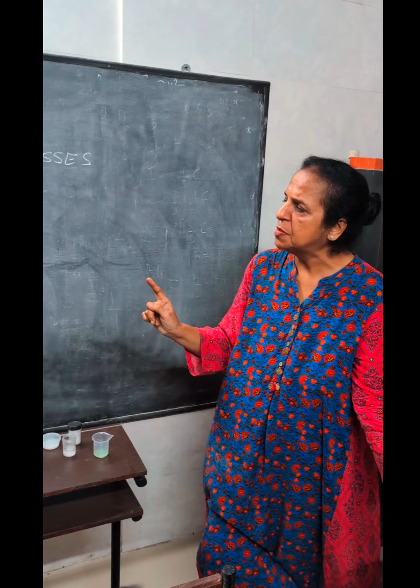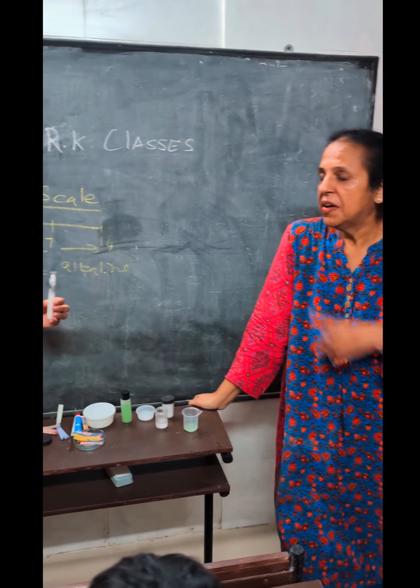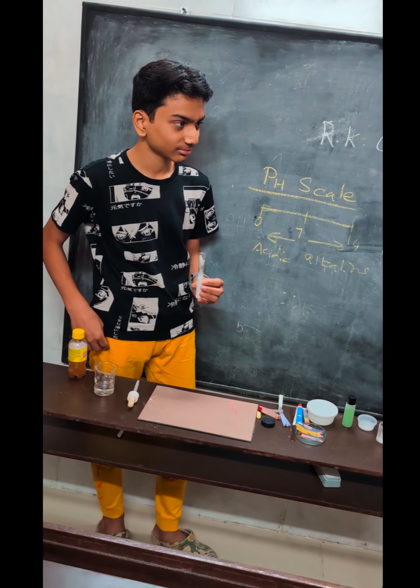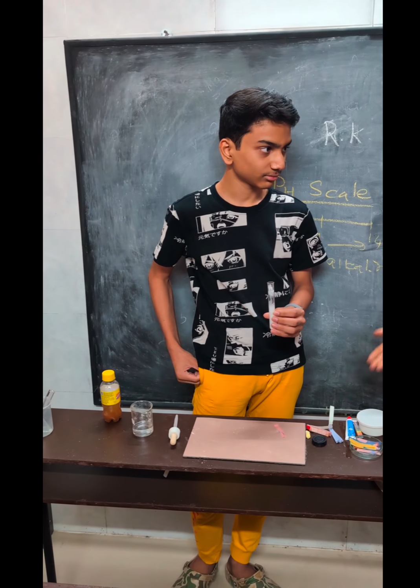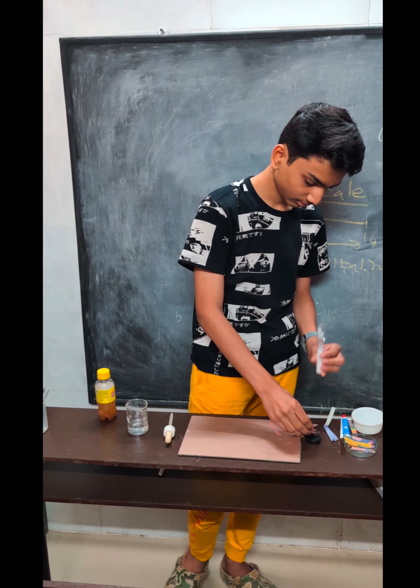Before trying the litmus paper, what do you think should be the nature of the solution in this test tube? Acidic, basic or alkaline? Basic or alkaline is the same here. He says basic. So which litmus paper will you go with? Show us.